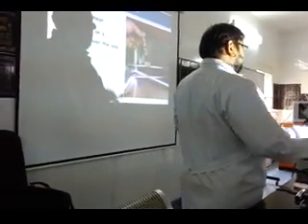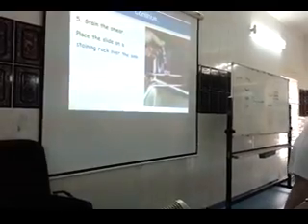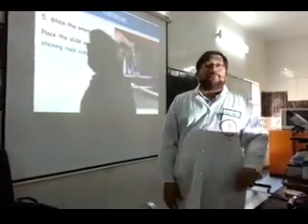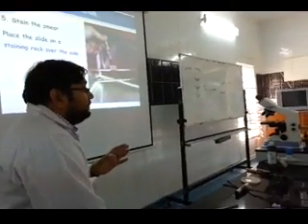Stain the smear. Then you put the slide on the sink, like this, and you will stain. You got it? If you make a good smear, you make a good stain. If you don't make a good smear, you make a bad stain.